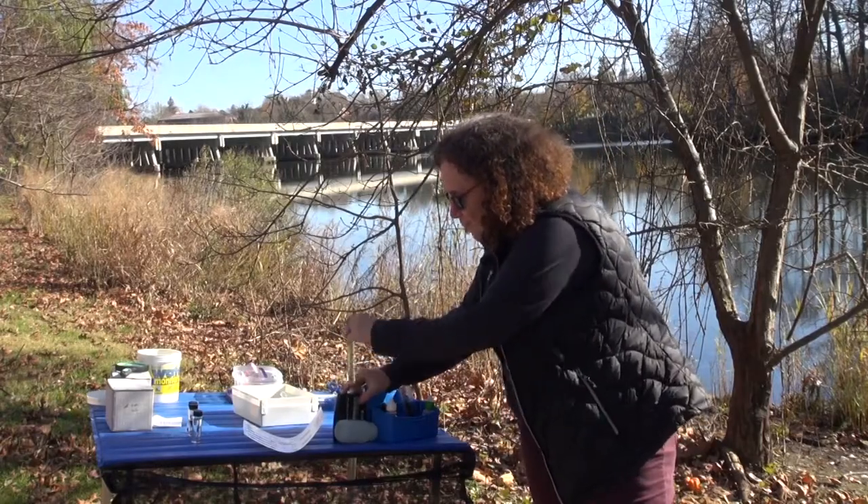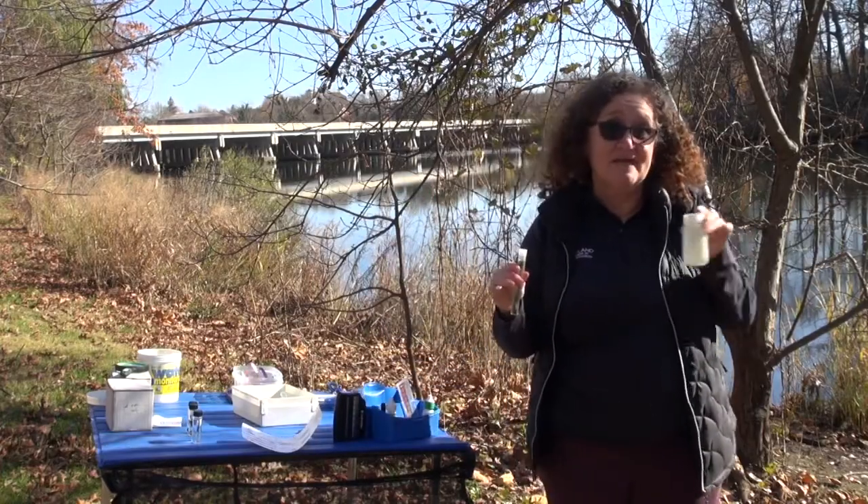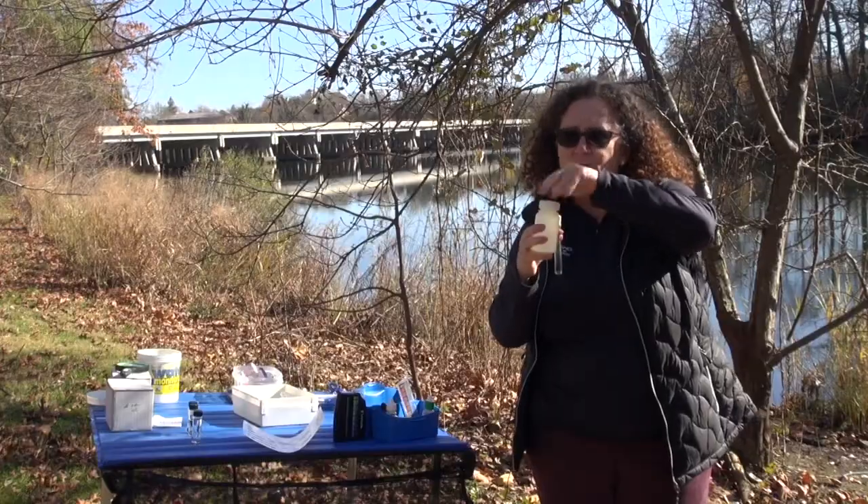Another important step when you're doing water quality tests: these are chemicals, so we don't want to put them back into the body of water. You always have a waste jar. Then you want to follow the directions in the test kit on how to dispose of it properly.